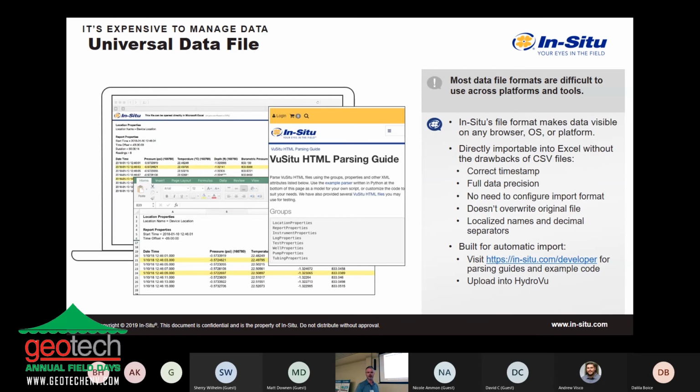And again, this is kind of the parsing guide I was just talking about. And that mark button that I was showing you with the yellow. So if you hit mark on your test, and you get your report, that's exactly what it's going to look like right there. It's just going to say, hey, I saw something funky, and I want to review it later.